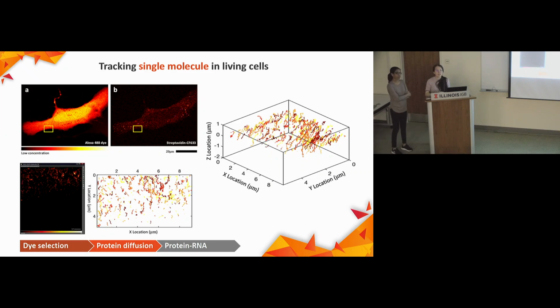So it can lose track of them, but you also sometimes program an upper limit of how long it takes to catch it, so that way it switches to a new molecule, or you just watch one molecule until it loses it. Yeah, watch one molecule until they lose it, and then they go to the other one. For some of the trajectories we are getting really long, like 600 milliseconds. For some, they lose track very fast, 70 milliseconds. So it varies from trajectory to trajectory.